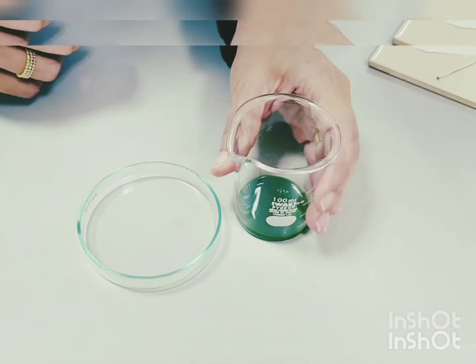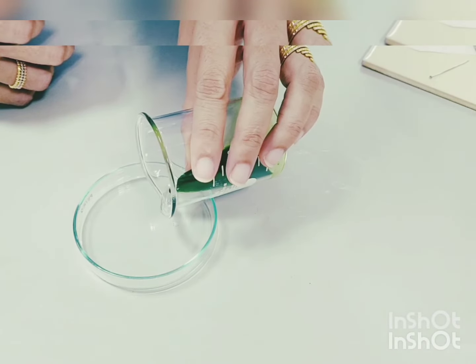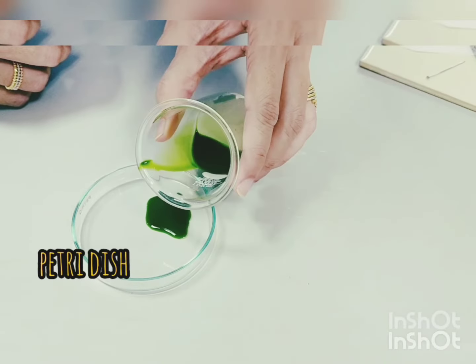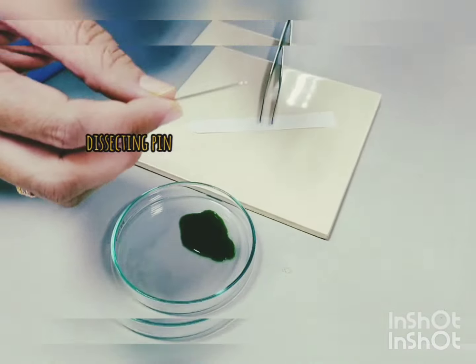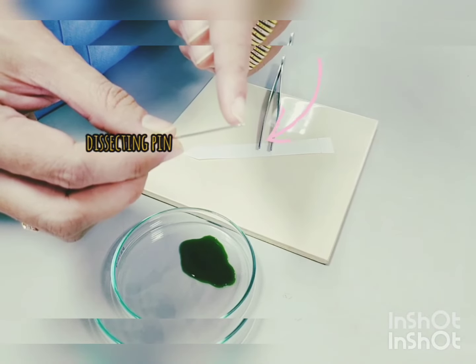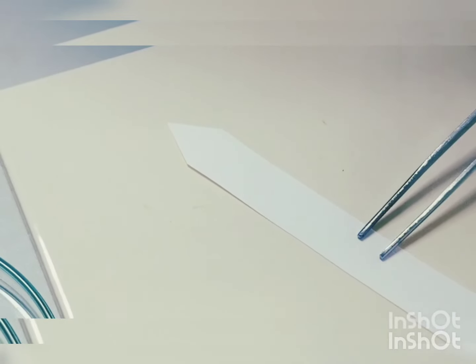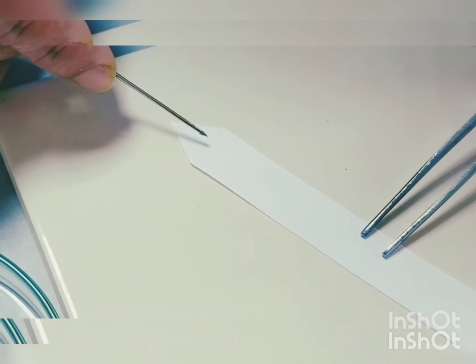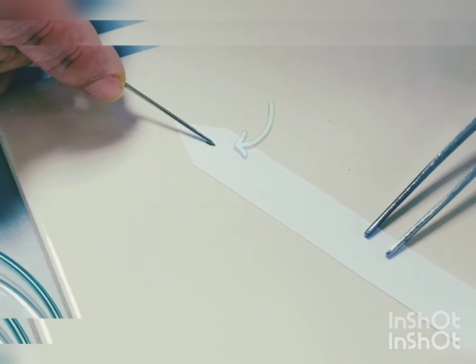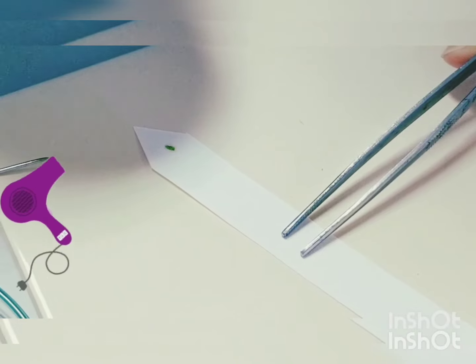Transfer some of the chlorophyll extract from the beaker into the petri dish. Using the tip of the dissecting pin, place a drop of the chlorophyll extract onto the chromatography paper. Using hairdryer, let the drop dry completely.